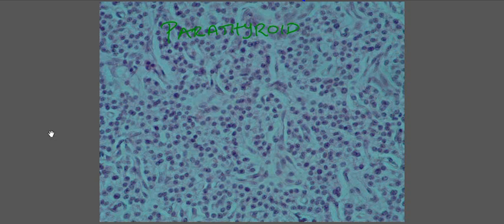Okay. So which ones are the ones that are congregated? The chief cells, right? So here we can see that all these ones are chief cells. Now the oxyphil cells are more spread apart, pretty much lonely. I mean, they're kind of hard to tell. There's one here.